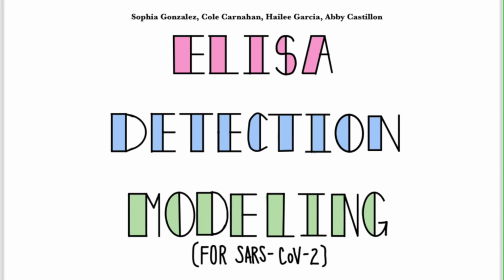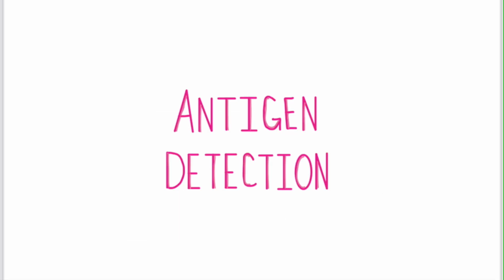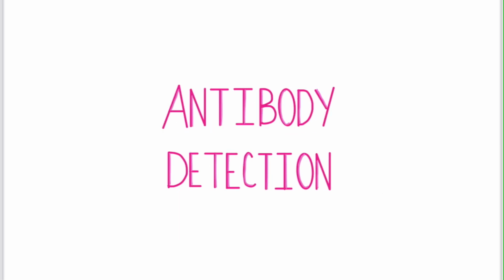Hi everyone, and welcome to our demonstration of ELISA disease detection modeling for SARS-CoV-2, the virus that causes COVID-19. In this video, we'll show how two types of ELISA tests, antigen detection and antibody detection, are used to diagnose infection and measure immune response.